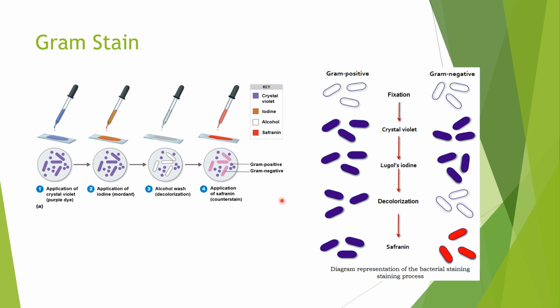We are going to talk about the gram staining procedure in more detail in the lab. But again, I'm just going to introduce you to what the gram stain is and quickly go over the steps, briefly.